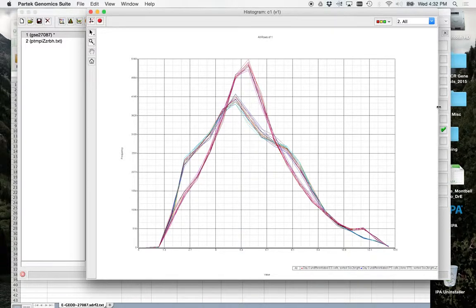What do you think? So let me explain this. Actually, I have to explain it here because that's where my mic is. This is basically a histogram of the intensity of the signal. You'll notice that it starts at about 1 and ends up at about 13, right? Most genes are expressed in this area here.